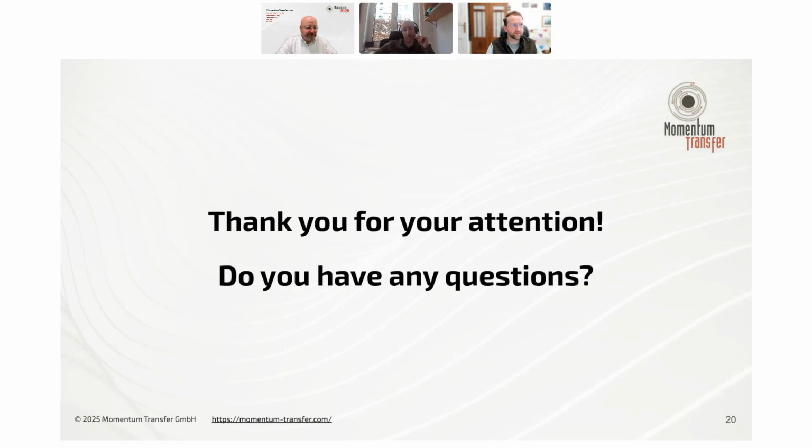We do also do total scattering and PDF analysis, which is collecting the data over a much larger Q range to access a higher spatial resolution of the information. And then you can analyze the pair distribution function to look directly at the local structure. So I can't speak to if in your specific case it's possible to resolve the differences between those scenarios, but that would be the best way to probe that.